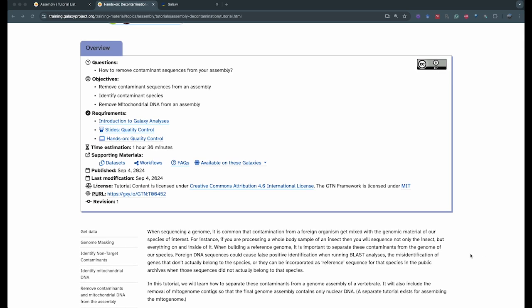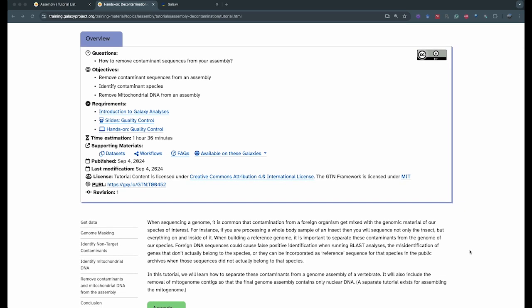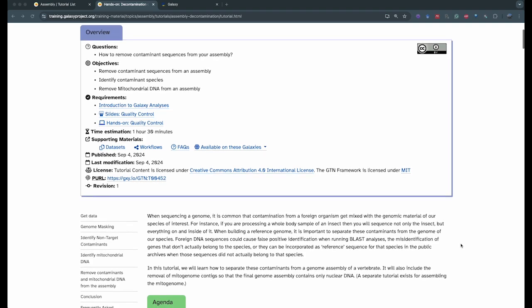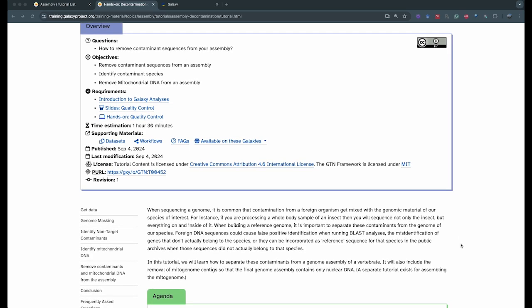This contamination can be bacterial, viruses, or human contamination when you get the samples. You can also have plants if you're sequencing material from a stomach. So when you want to build a reference genome, you want to have only the nuclear DNA of your species. This workflow includes decontaminating DNA from other species, but also removing the mitochondrial DNA to separate it from the nuclear DNA and build a reference assembly for your species.